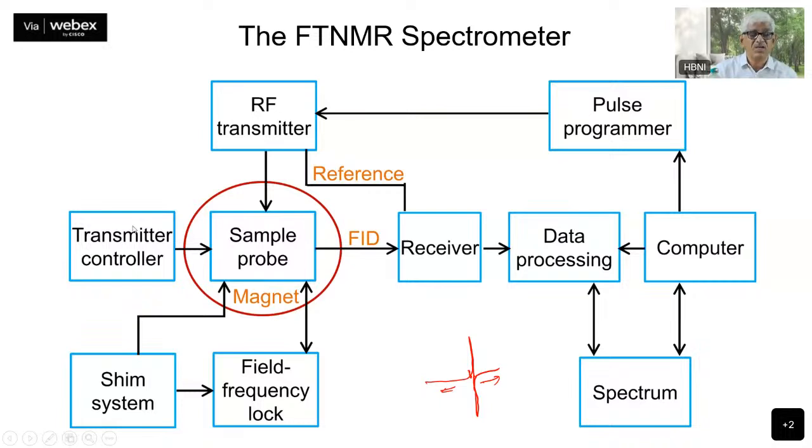Who controls that? That is controlled by this. You can design how much time gap resolution you can have, nanosecond time resolution. So you can have precise control of the duration of your pulse, whether it should be a 90-degree pulse, 180-degree pulse, all that is designed by this transmitter control.